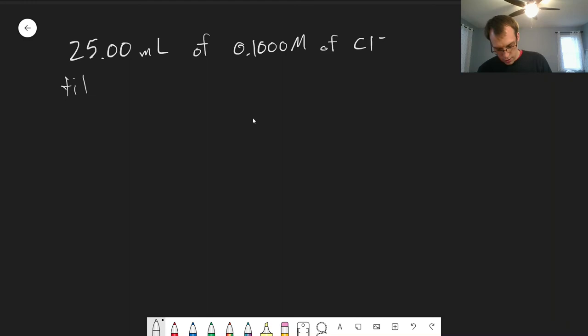And we're going to titrate with a standard silver solution that has a concentration of 0.05 molar.